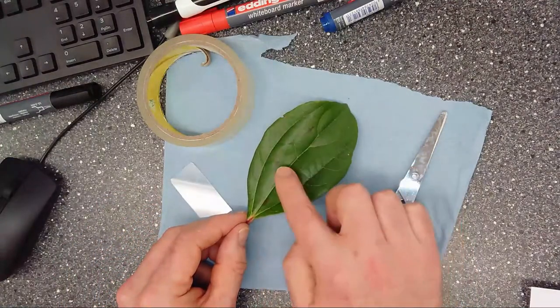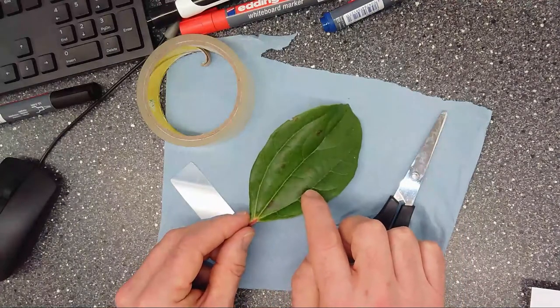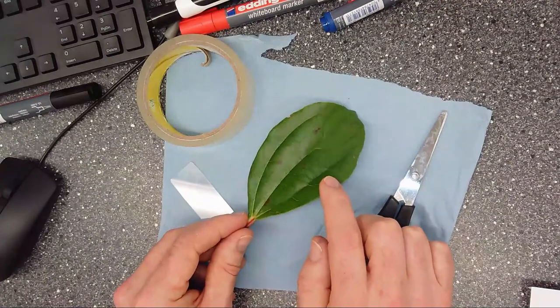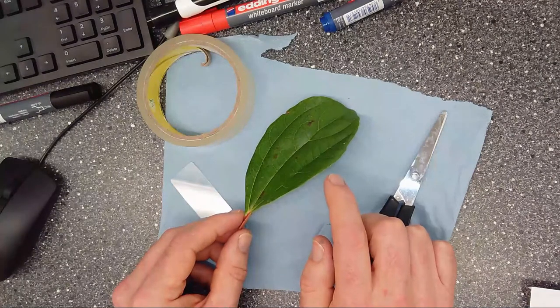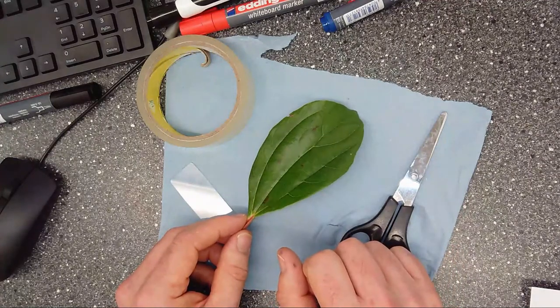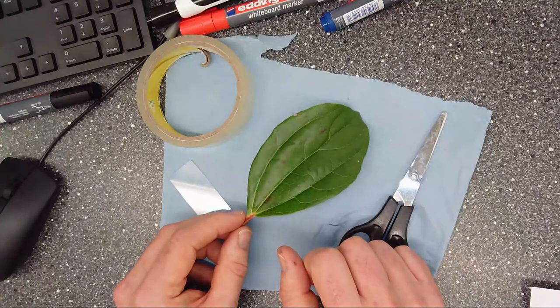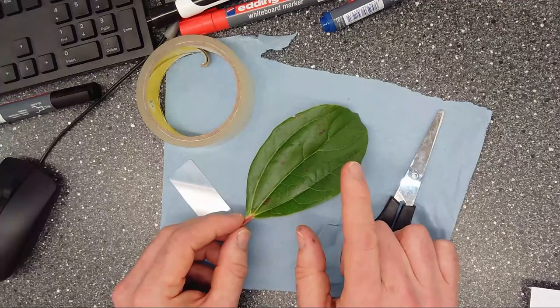As you can see, what would you call this top bit here? What do you notice about it? Yeah, it is shiny. Why is it shiny? Yeah, so it's got a thick waxy cuticle. Whenever you see a shiny surface on a leaf, there are usually not many stomata, if any, on the top, because you don't want evaporation of water coming out of the top of the leaf.